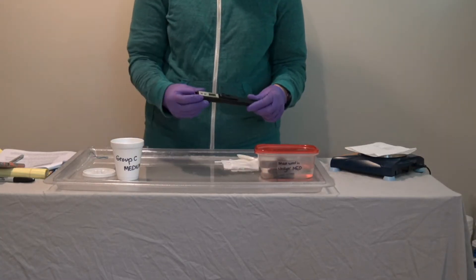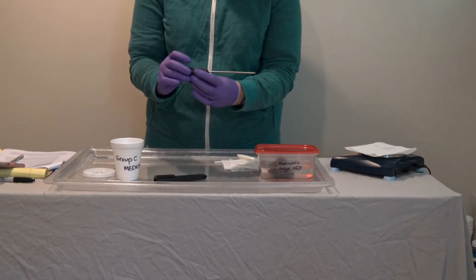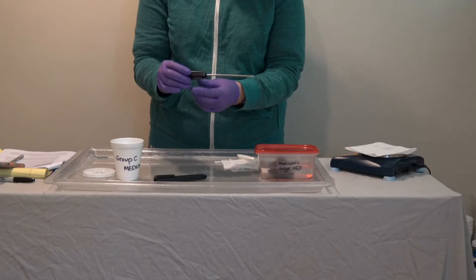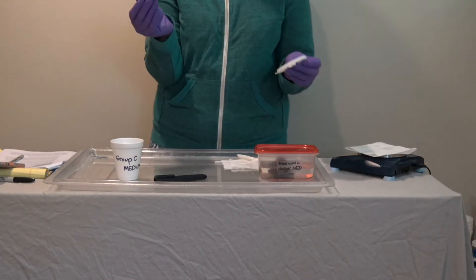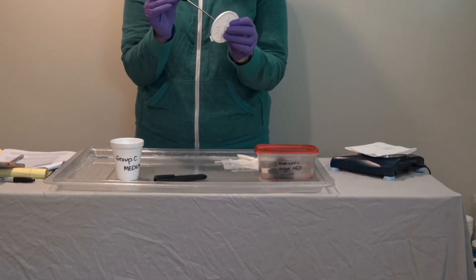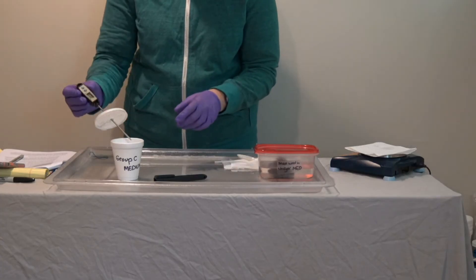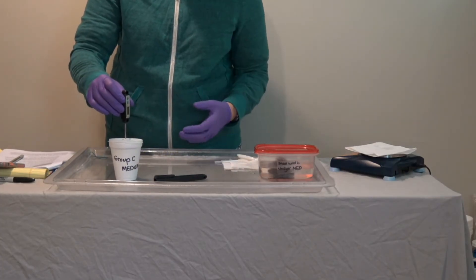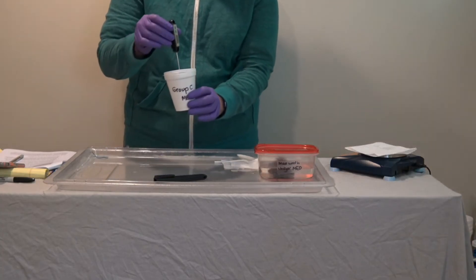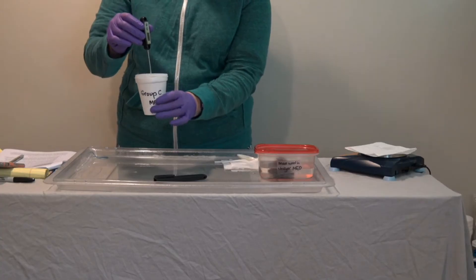First, students will want to take their digital thermometer, turn it on, and make sure it is reading degrees Celsius. Next, they'll want to poke the thermometer through the small hole in the lid of the styrofoam cup to set that depth so they can hold the thermometer in the cup without it puncturing the bottom or hitting the sides.